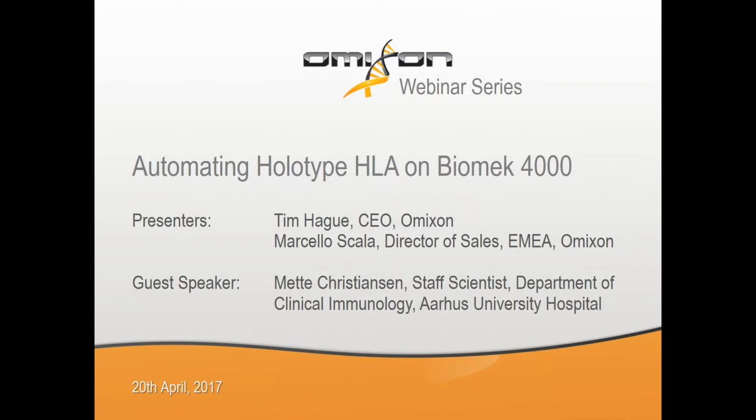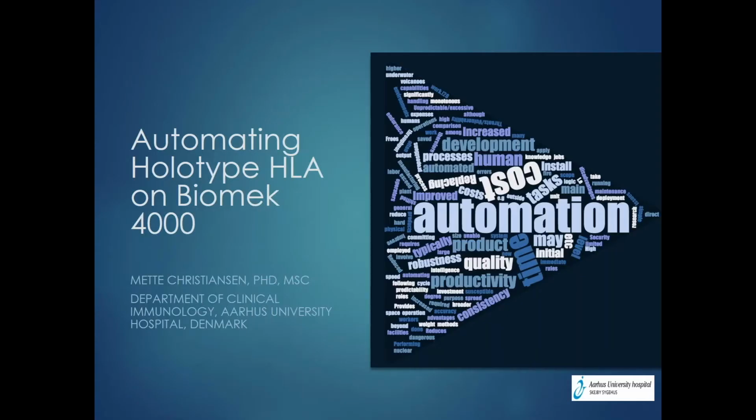I'm also very glad to have here with us Tim Hague, the CEO of Omixon, who is going to give us a live demonstration of the Omixon HLA Twin software. Our agenda for today is Mette will present her work on the Biomek 4000, and then Tim will give you a live demonstration of the latest updated version of the Omixon HLA Twin software. And finally, there will be the Q&A session where Mette and of course us will answer your questions, so please wait until the end of the presentation.